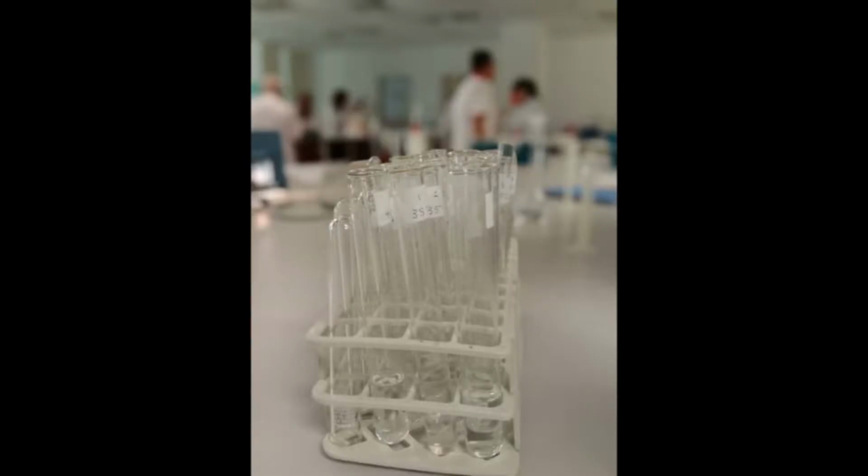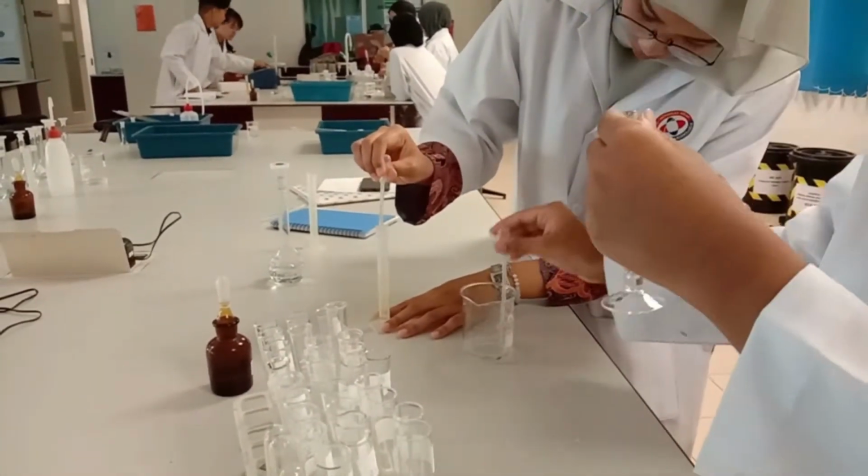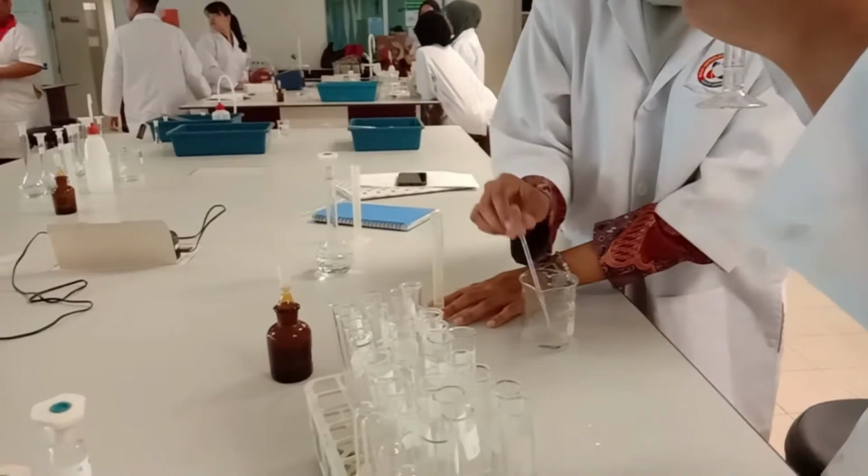8 milliliters of 0.01 mg/ml, 0.025 mg/ml, 0.05 mg/ml, 0.1 mg/ml, 0.3 mg/ml, 0.5 mg/ml, 0.7 mg/ml and 1.0 mg/ml were added into different test tubes. 8 milliliters of distilled water and 1 milliliter of amylase were added in the test tube.